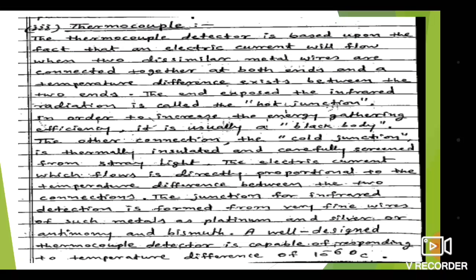Then thermocouple. The next detector is the thermocouple. The thermocouple detector is based upon the fact that an electric current will flow when two dissimilar metal wires are connected together at both ends, and a temperature difference exists between the two ends.